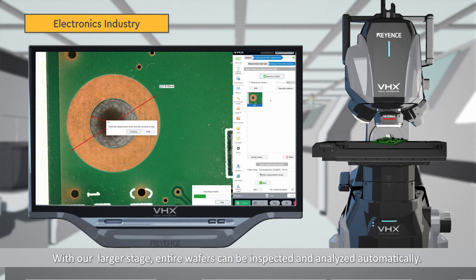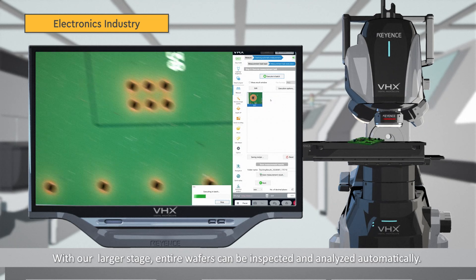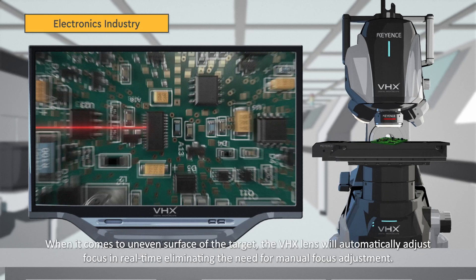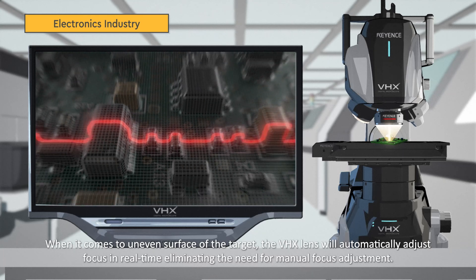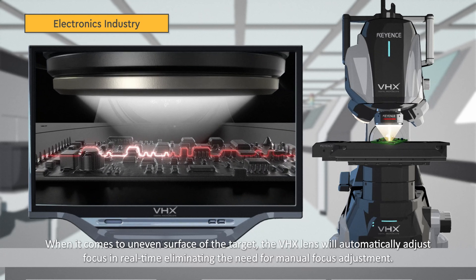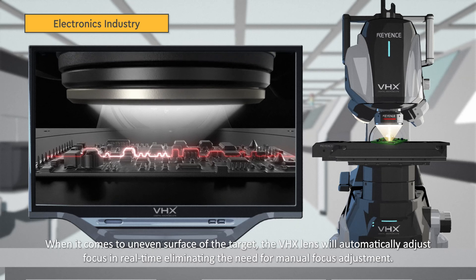With our larger stage, entire wafers can be inspected and analyzed automatically. Automatic image stitching is also possible thanks to ultra-high speed and precise movements. When it comes to an uneven surface of the target, the VHX lens will automatically adjust focus in real-time, eliminating the need for manual focus adjustment.